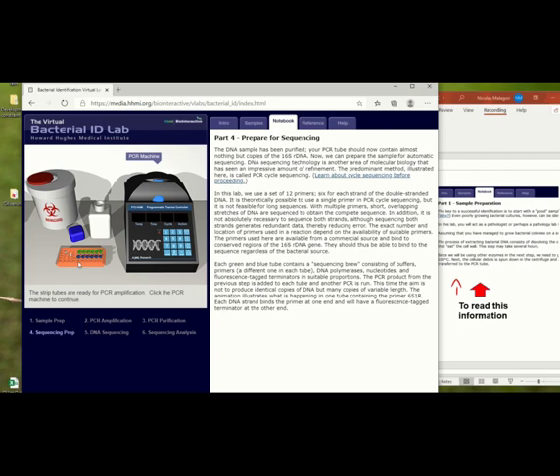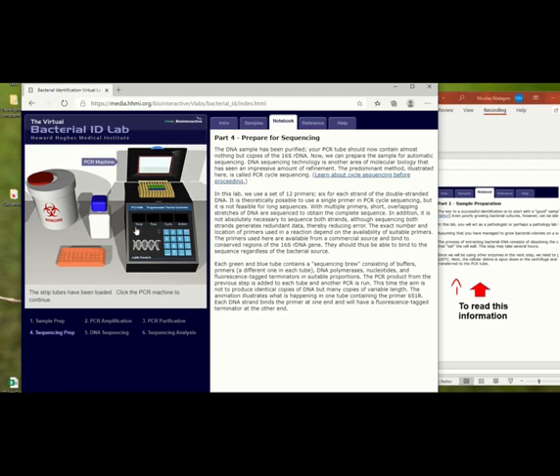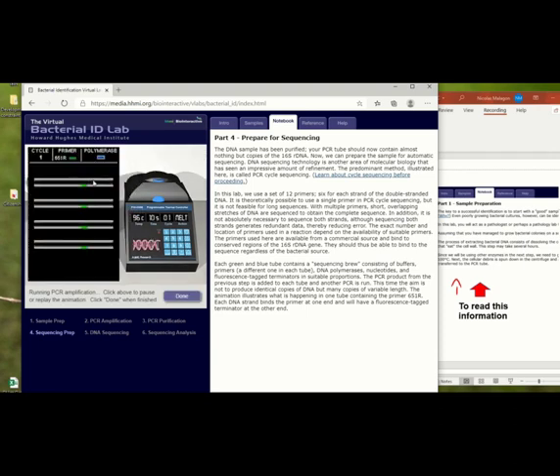Click the PCR machine, so click here, we put everything here again, and now we're copying again PCR of all the samples. And now we have all this sequence.